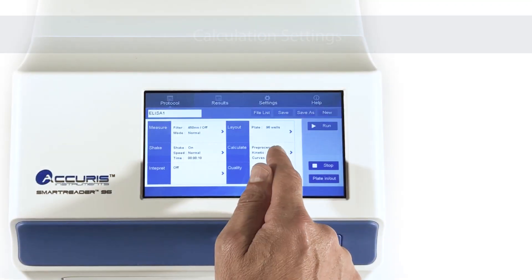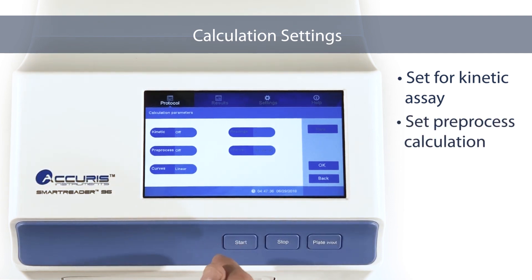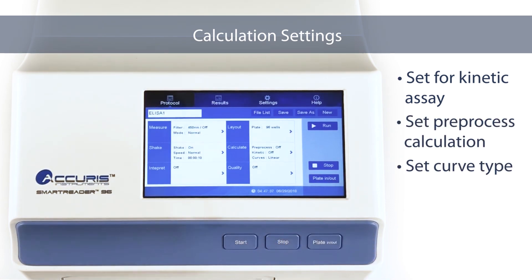Calculation Settings. Press the Calculate section to open up the calculation options. You can choose a kinetic assay, set the pre-processed calculations, and set the curve type.